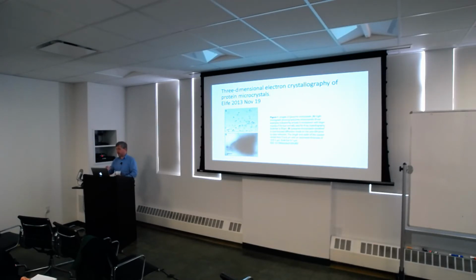Because your wavelength is so tiny, if your crystal is high enough quality and your ice is thin enough and everything is thin, they've seen like 1 angstrom. I guess X-ray has gone further than that. It depends on what wavelength you're using in X-ray too. And it depends on the detector probably too, right? Because the intensity falls off, the scattering. Right, yeah.